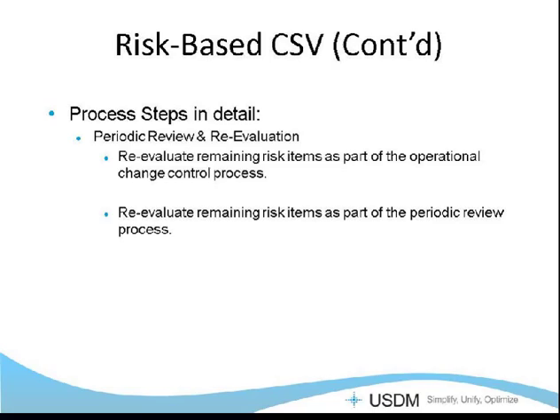So that's a good way to try to manage the amount of testing that you have to do and actually to focus your testing on the highest risk functionality of the system.